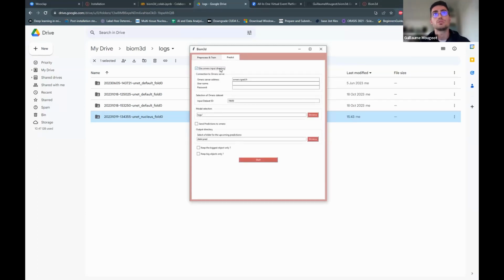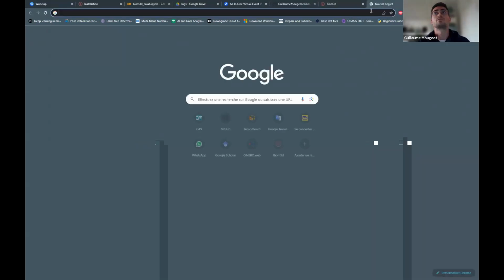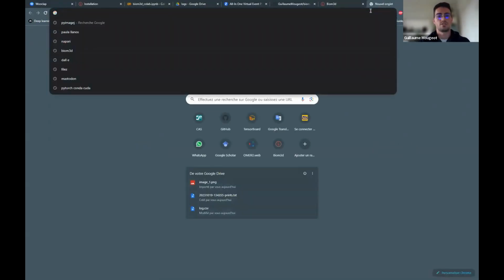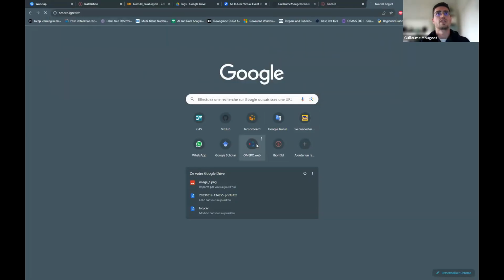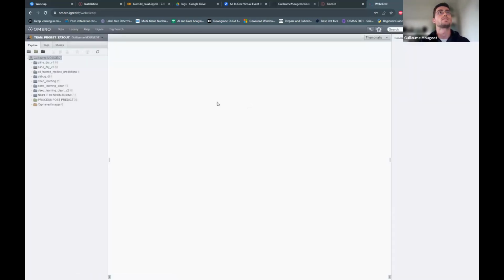For those who don't know, Omero is, I would say, a data manager for microscopic images. Let me just show you. I have one account here. I'll just present how it looks. So Omero is a data manager.